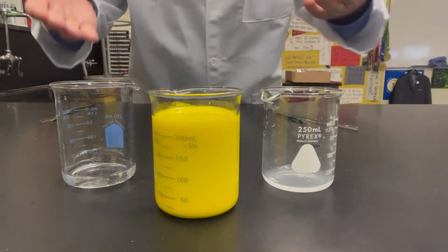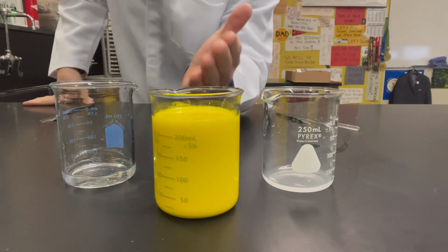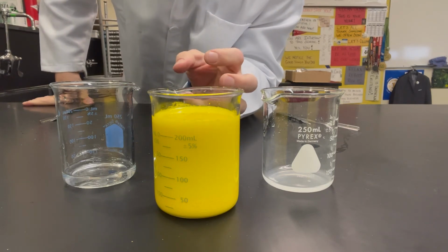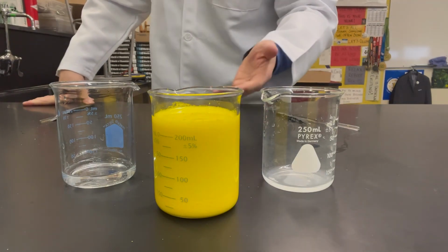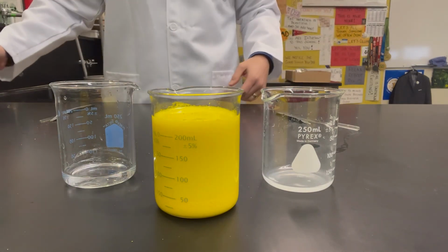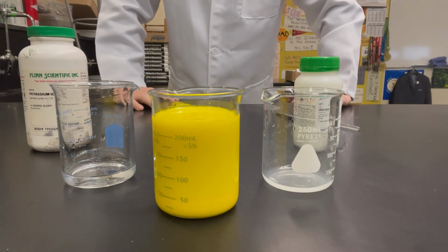Well, I don't know about you, but that looks like a reaction, absolutely. So why this liquid is yellow is actually there is a yellow solid that is now suspended in the liquid. And if we took filter paper and we strained out this liquid, you would actually end up with a yellow powder. And that yellow powder is, of course, that final product we predicted in our equation.